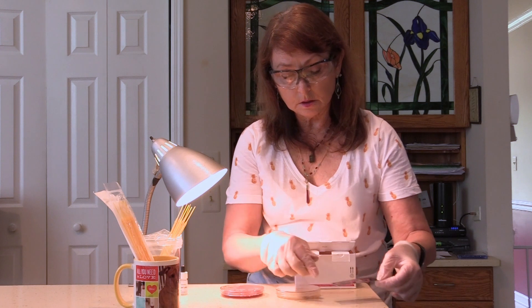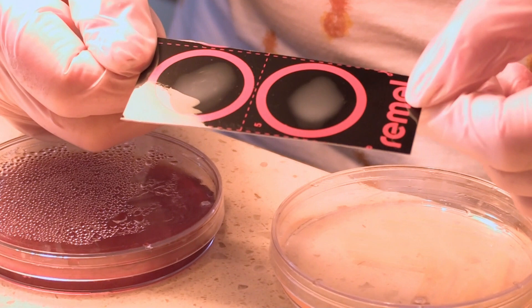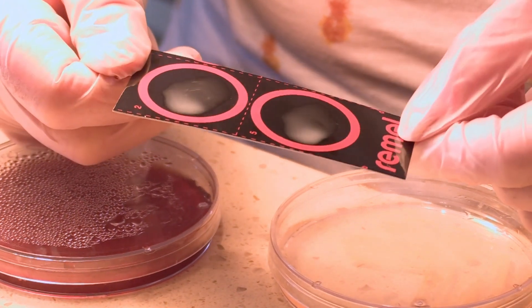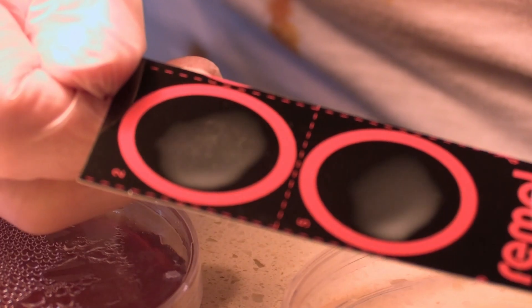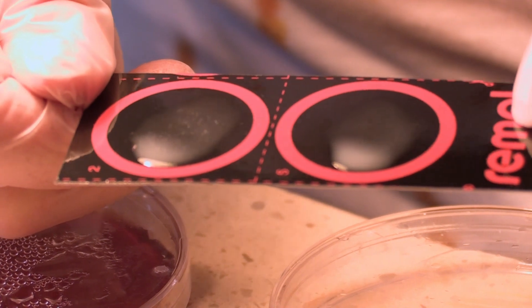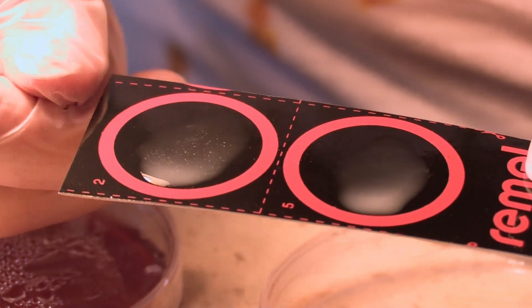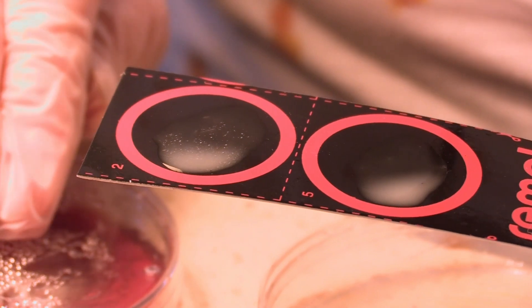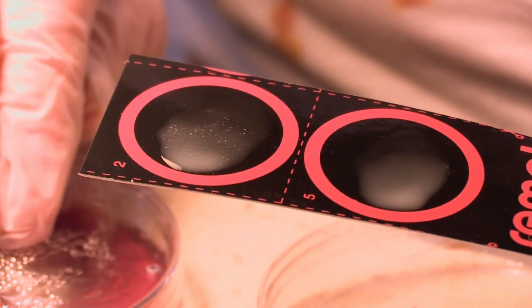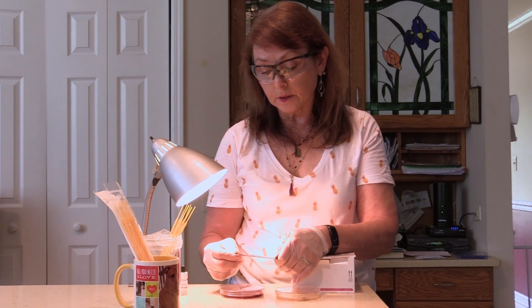The directions indicate that I want to take the slide and slowly rock it back and forth. In about 20 seconds I should see a positive reaction. A positive reaction is where we see agglutination or clumping, indicating Staph aureus. If there is no clumping or agglutination, it means it's not Staph aureus — in this case it would be Staph epidermidis.